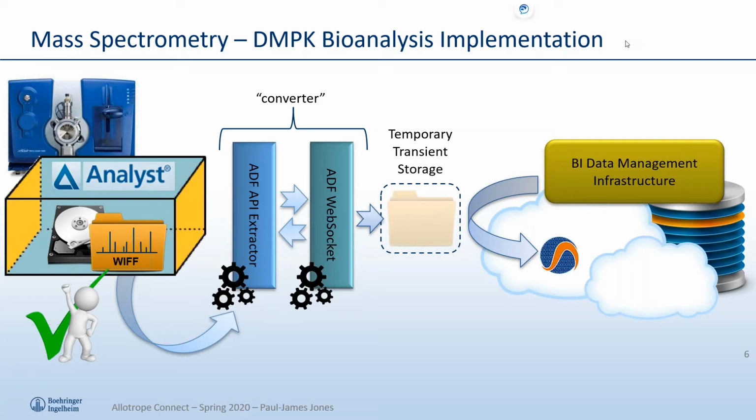When the scientist finally approves the data for archiving, that will be a manually triggered process, and then that data will be handed over to the converter, which will then create an ADF and deposit that in temporary transient storage, which will then be swept up by our BI data management infrastructure and handled internally. This is the overall workflow for the ADF files.